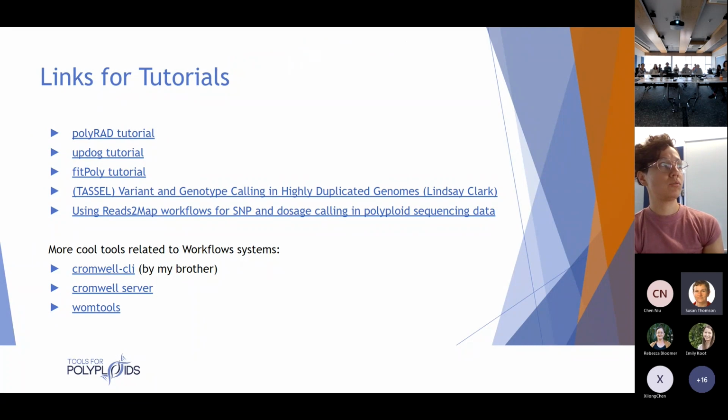If you want to do SNP calling, genotype calling with other software that's still not included, there are other tutorials that you can see. And also the workflows, it's very nice. I like it. And there are other tools that you can use for management and for tracking what it's doing. And there are other links here. And my brother did one very nice one for tracking if it's working, if it's not, which part of the workflow is running at the moment. And it's nice.